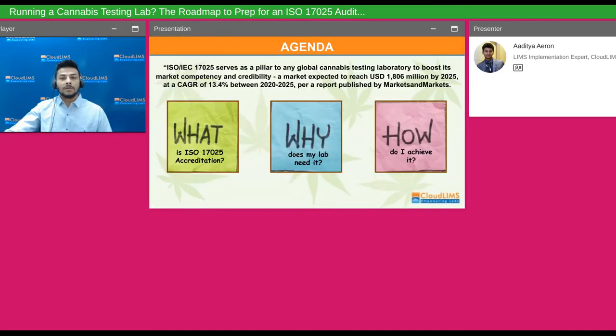We'll be covering what exactly this accreditation is, what is involved and what its requirements are, and then why your lab really needs it. I know you understand that a cannabis testing laboratory is an emerging business. It's got a huge market, but what are the other points that you need to make sure of for your journey in becoming a success?